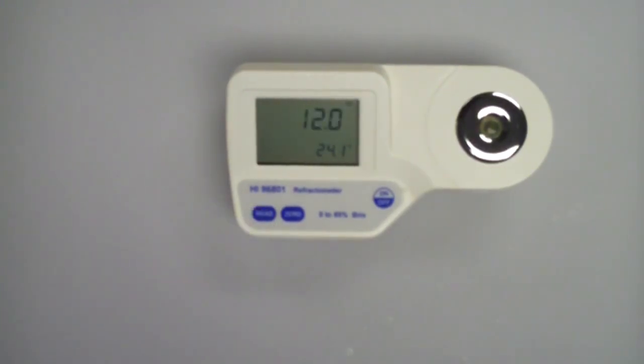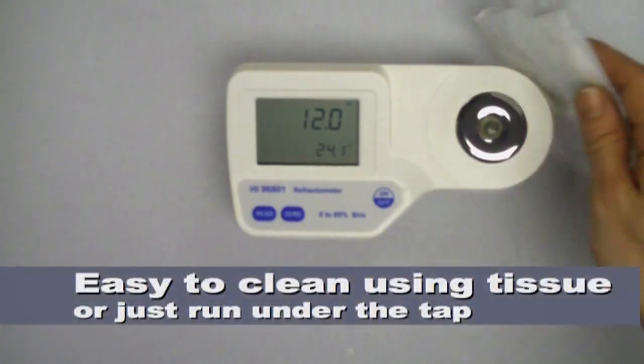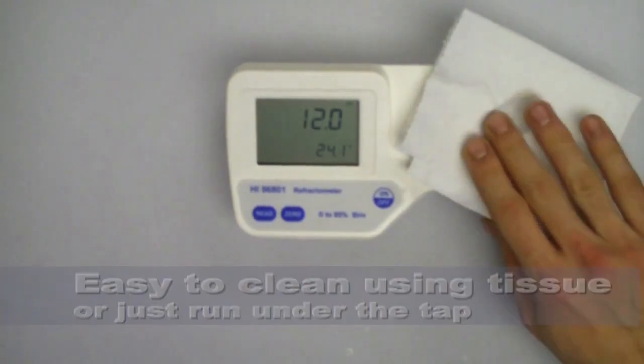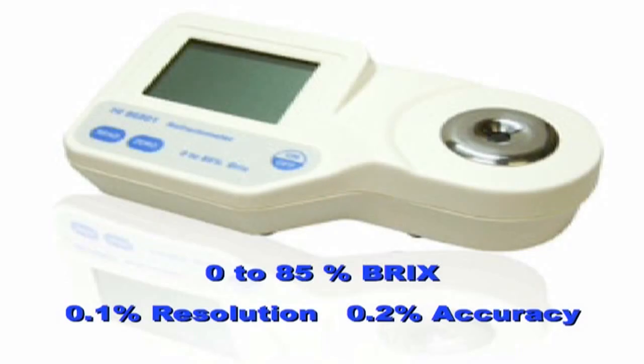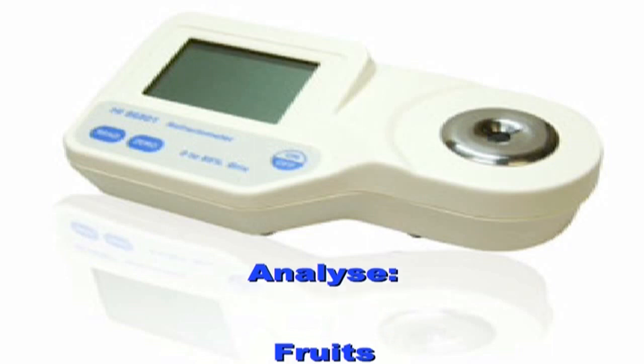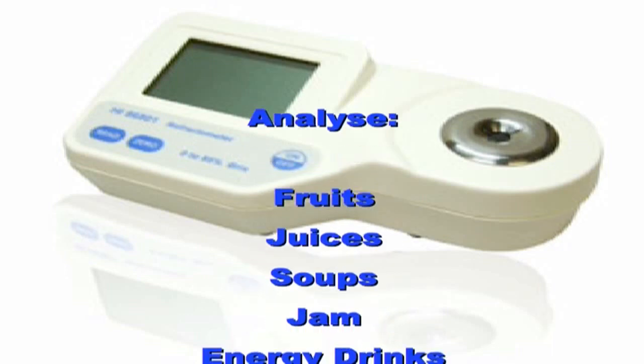Last but not least, with its waterproof case, it's quick and easy to clean — just use a tissue or run it under the tap. As you would expect from HANA, with their high levels of accuracy and resolution, the refractometers are both competitively priced and ideal for measuring a wide range of food and drink products.